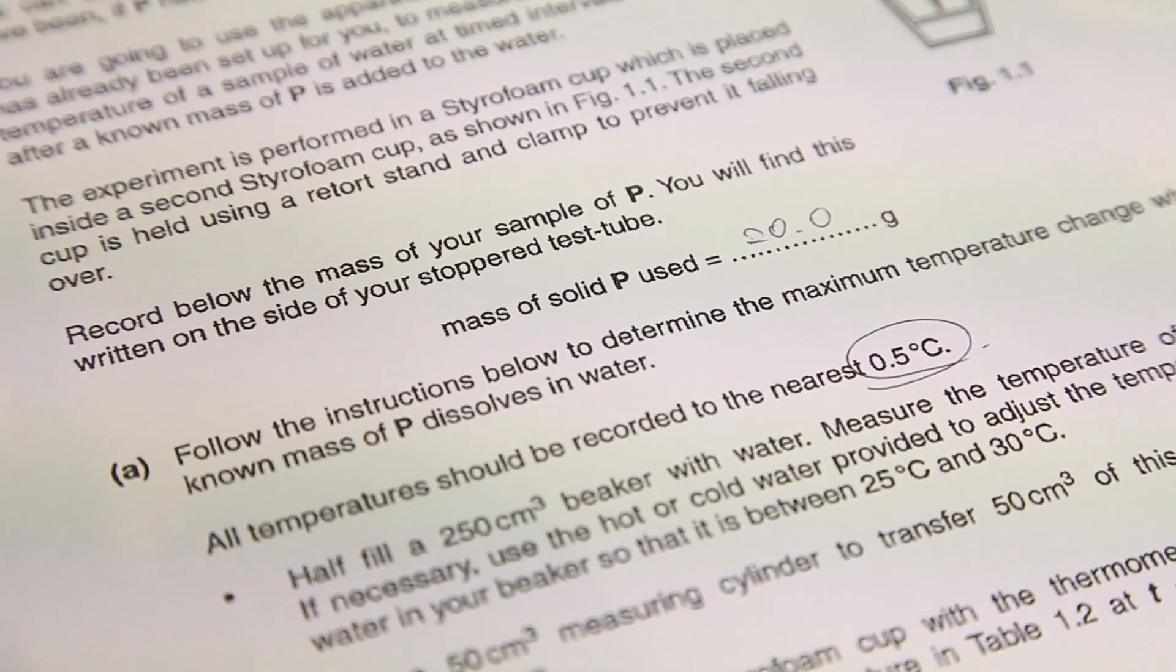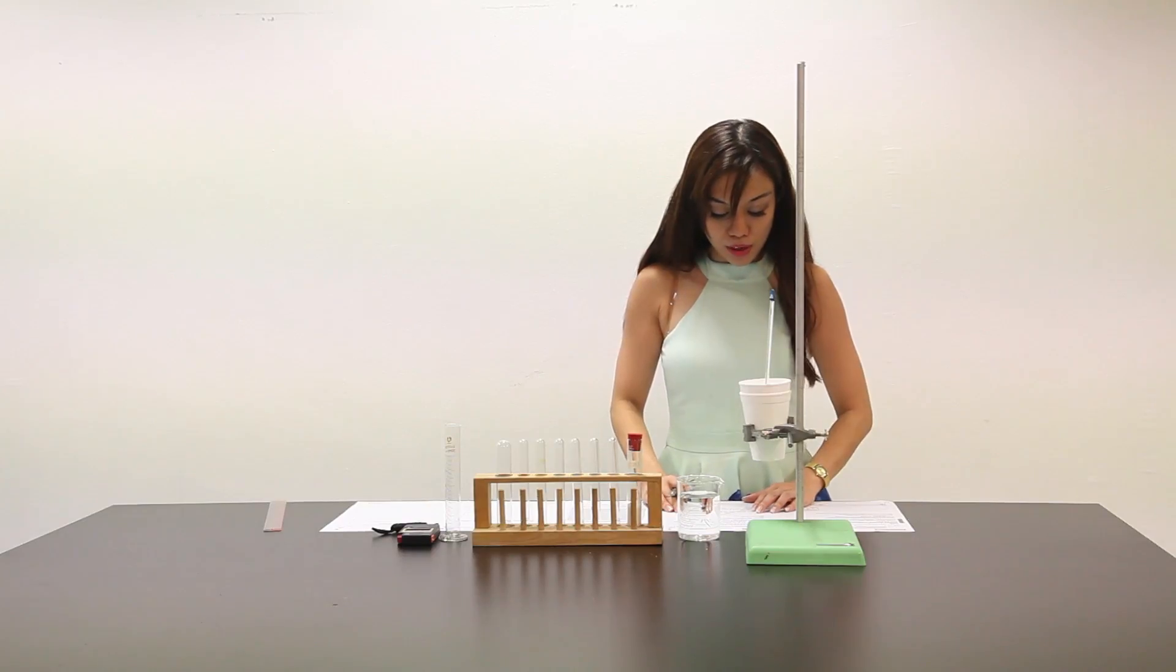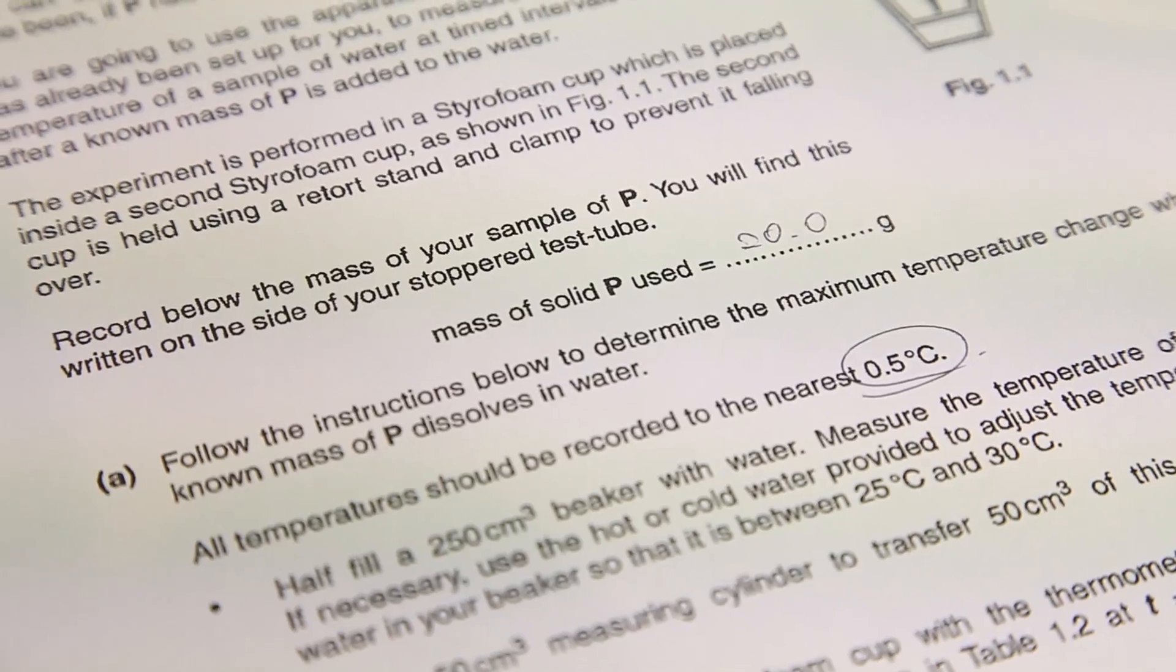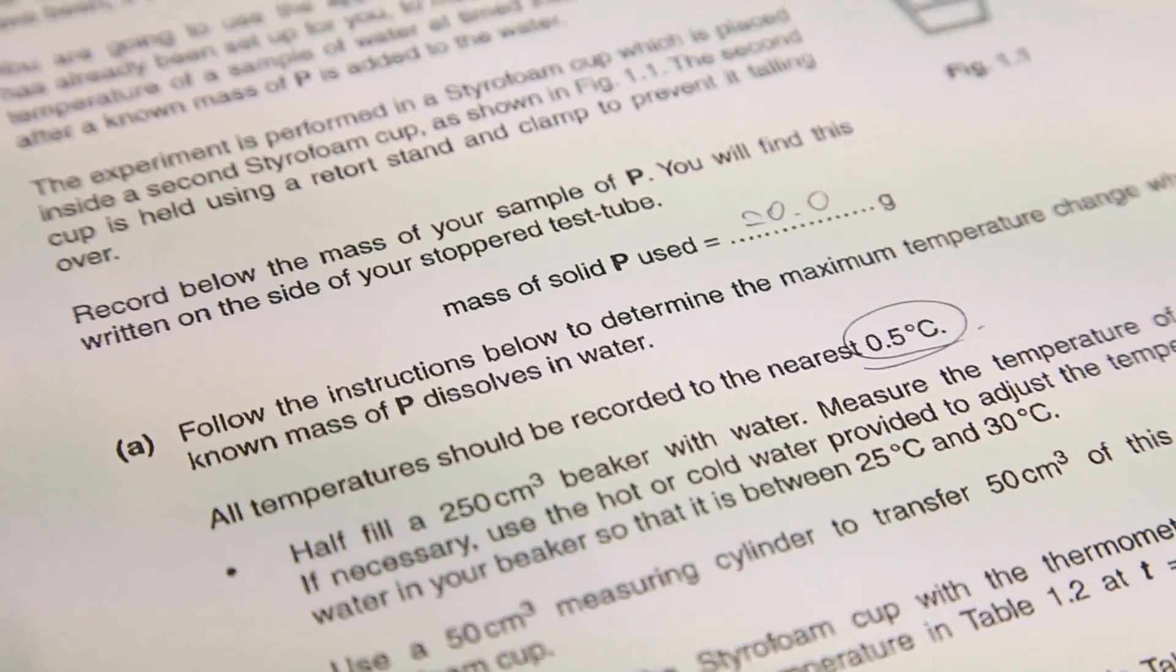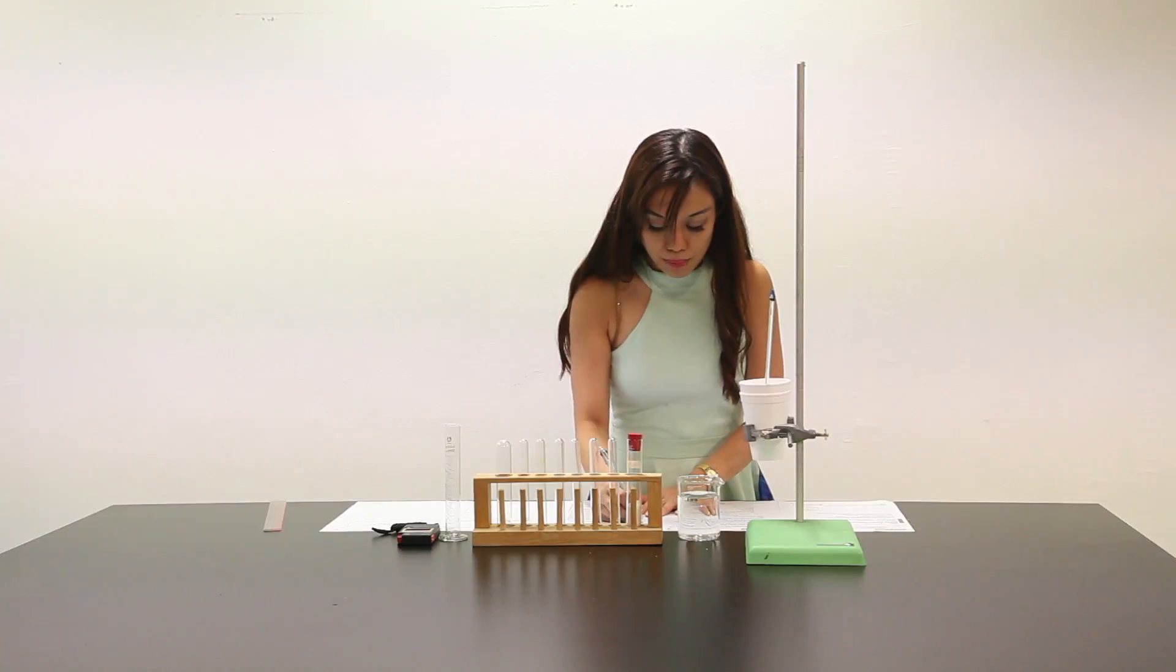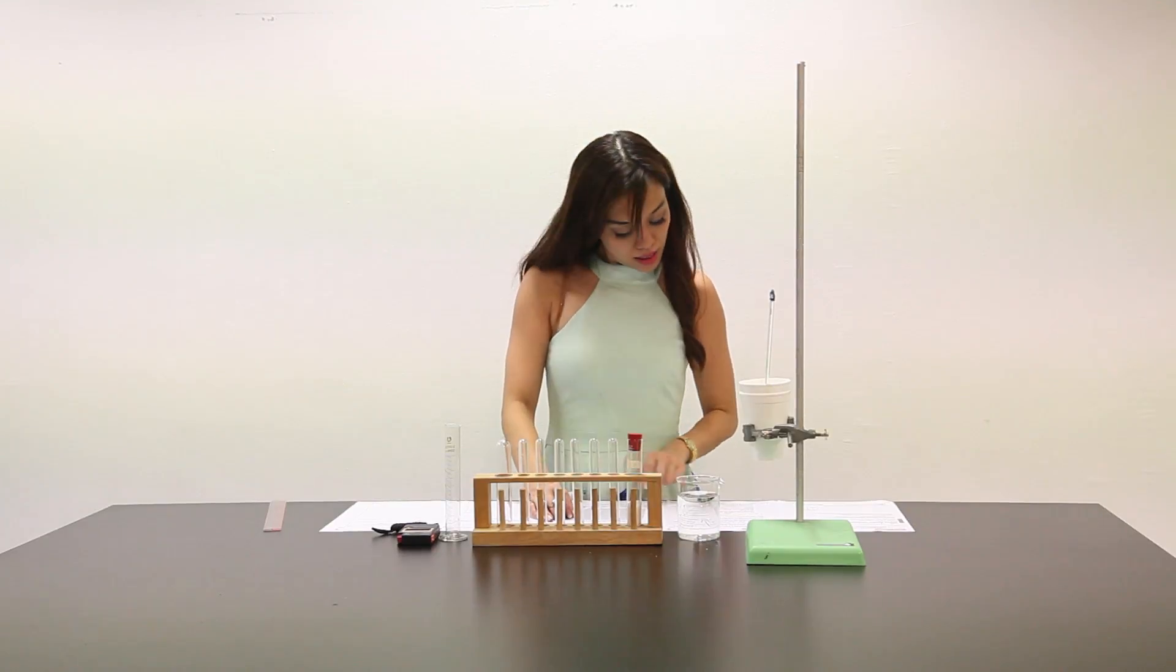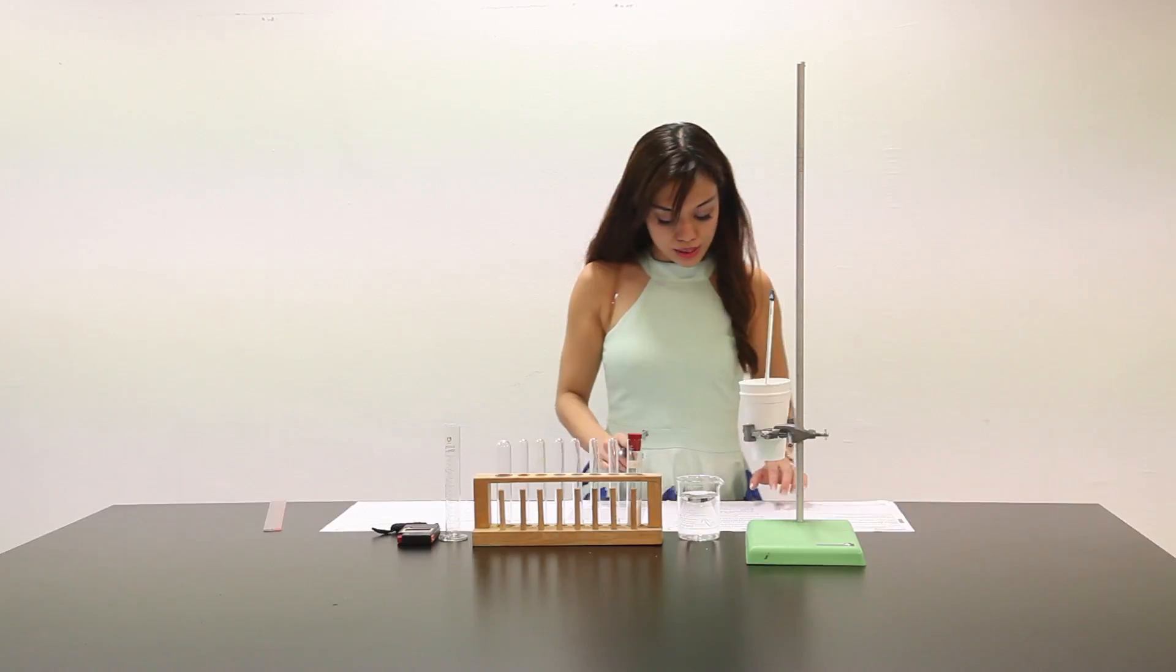Follow the instructions below to determine the maximum temperature change when a known mass of P dissolves in water. All temperatures should be recorded to the nearest 0.5 degrees Celsius. Let me write that the temperature is in 0.5 degrees Celsius increments, so I remember that it's 1 decimal place and only at 0.5 degrees Celsius.